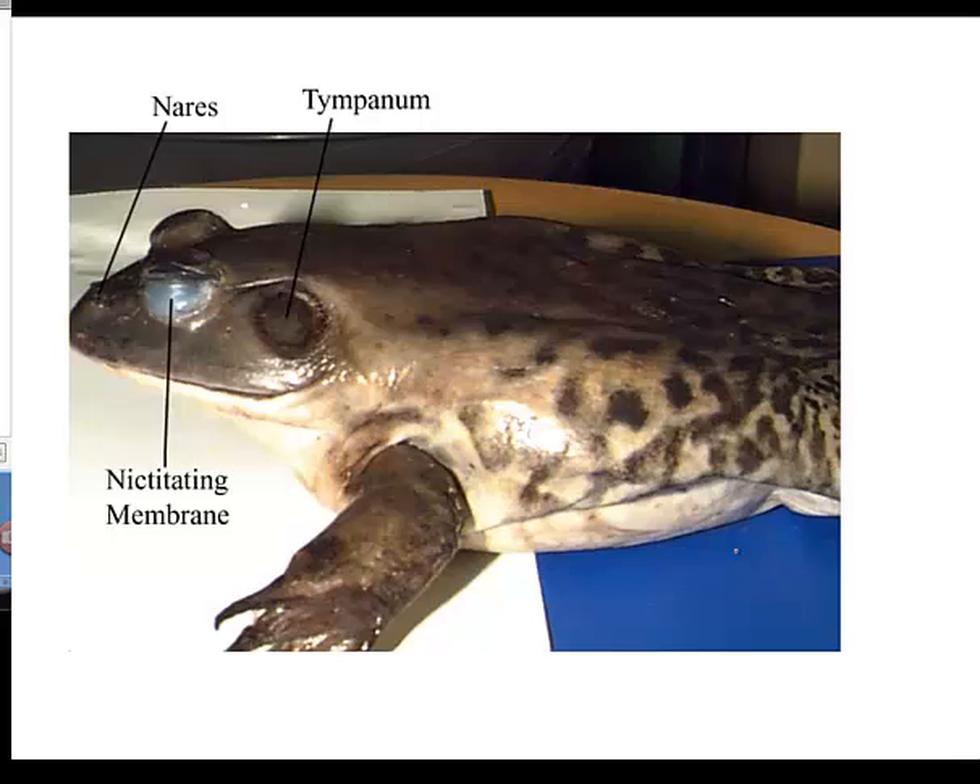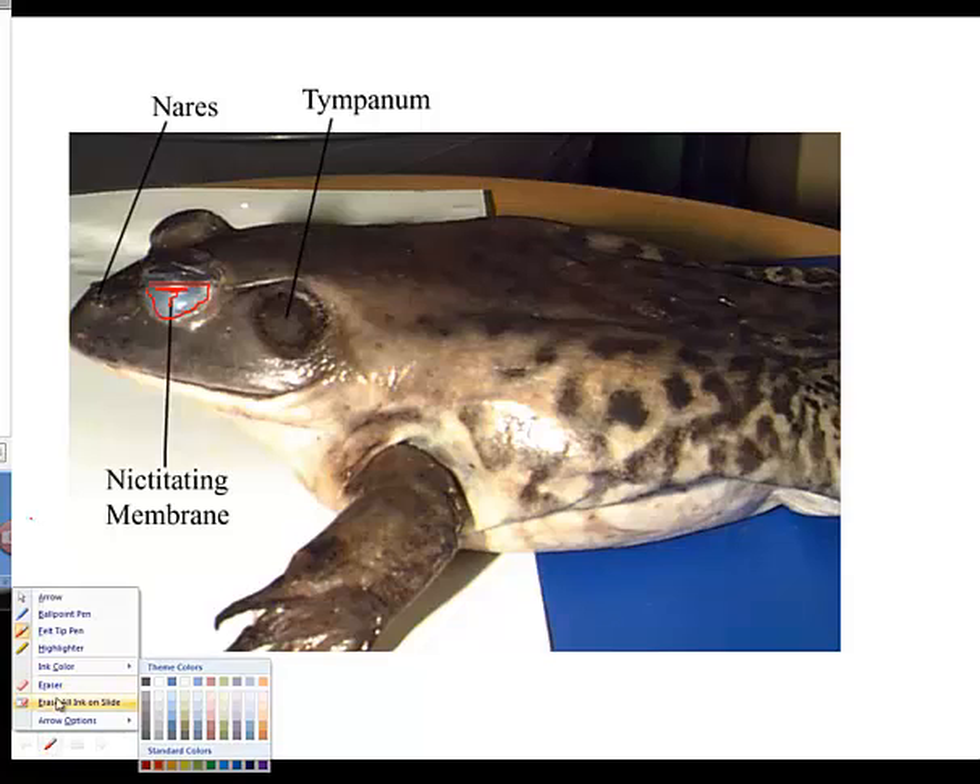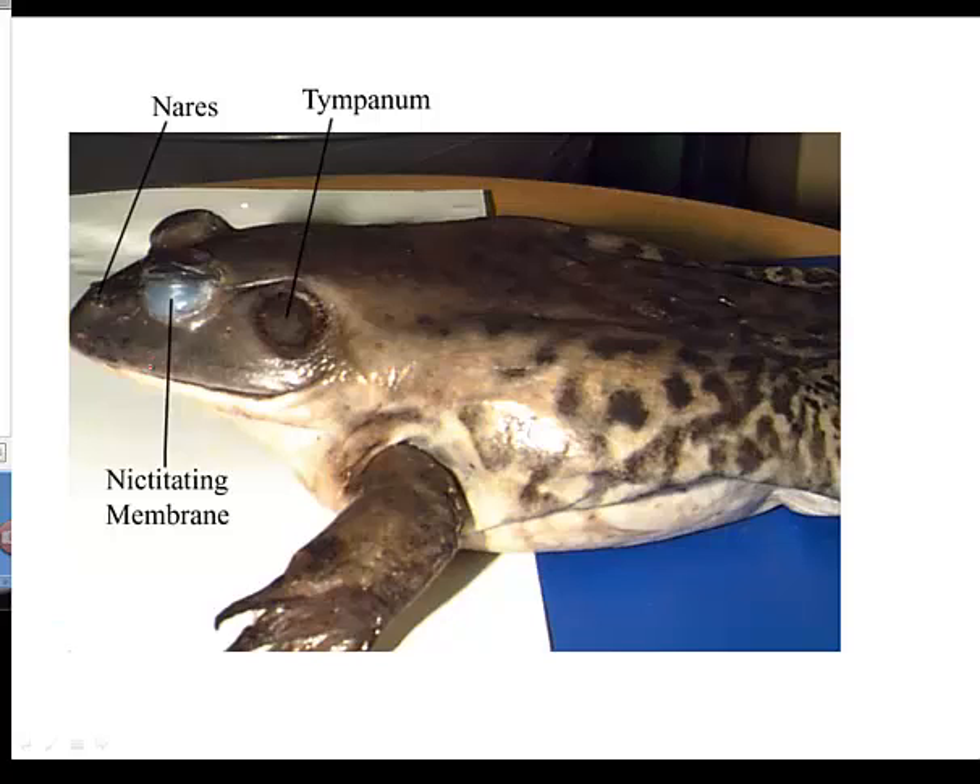One of the first things you're going to want to do is identify the eyes. The eyes have a non-movable upper and lower lid, and they are protected by the nictitating membrane. You see this film that is covering the eyes — that's your nictitating membrane. The nictitating membrane acts as a swim goggle, so it helps the frog see underwater, and it also helps prevent the eye from drying out when the frog is on land.